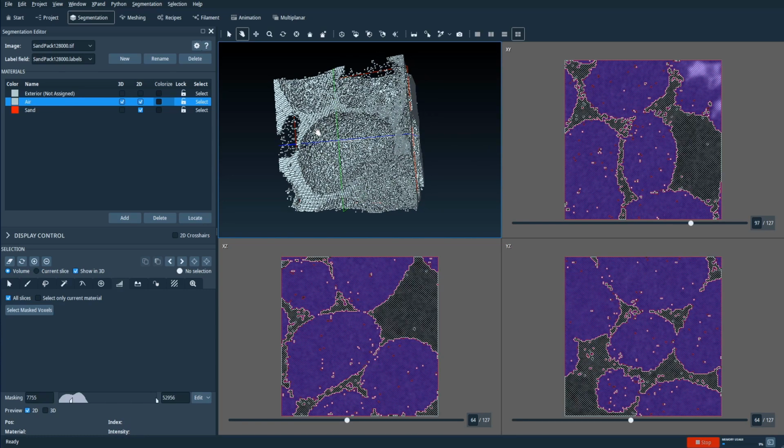And this is where pre-processing can come in, right? So because I know that my data set has noise, then I can, let's say, decide that maybe I can do some step before segmentation to try to get rid of the noise over here. Now, it's a different story if these tiny particles over here actually correspond to parts of the data or object that you're interested in, right?